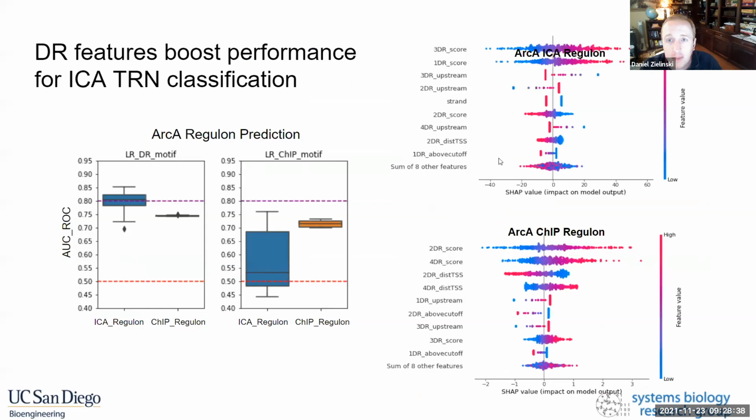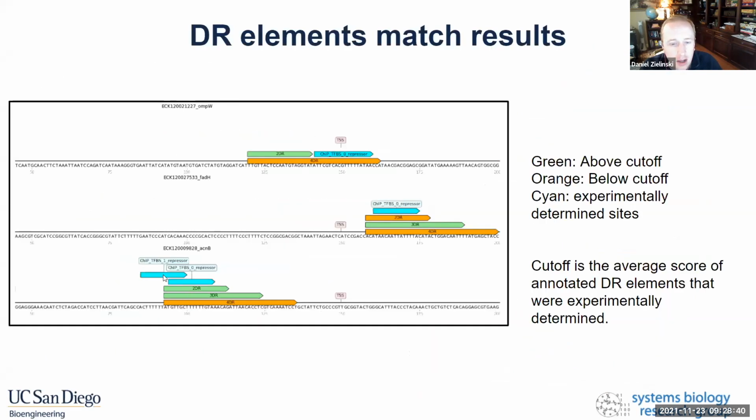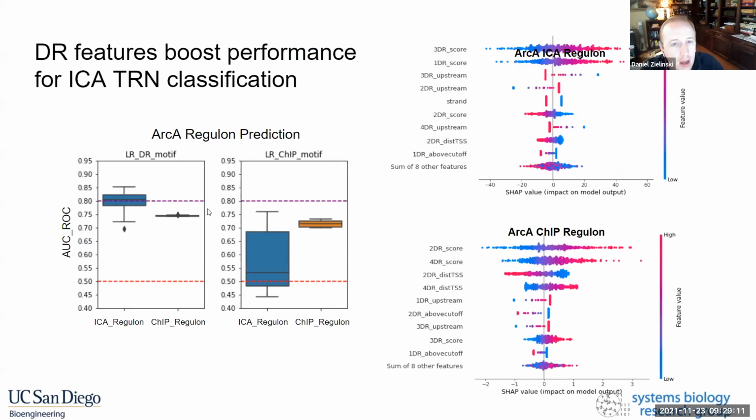And you could see, if we map this on promoters, you can actually see these direct repeats. So here's a transcription start site, and you can see a 4 direct repeat RK motif right next to the ChIP binding site. So that's really nice to see. You can actually visualize these direct repeats directly on top of the ChIP data, which is another benefit of the Bitome data structure. You can easily match these data architectures.